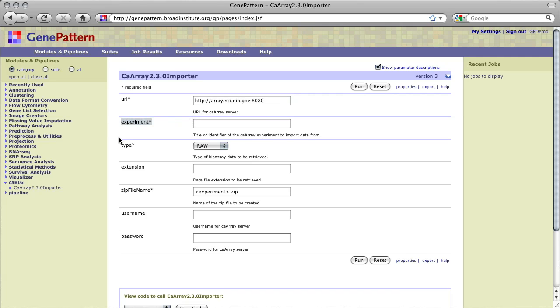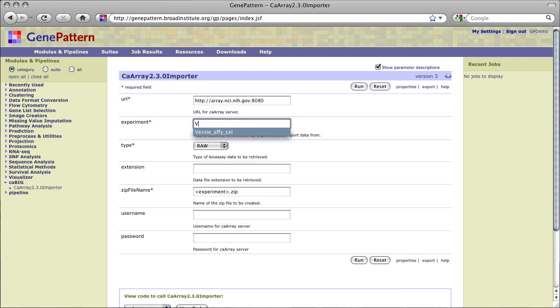The experiment refers to the title or public identifier of the experiment in CA Array from which the data is to be imported. If we didn't already have a title or public ID for an experiment, we could go to the repository we are using and browse to or search for the experiment which contains data we wish to import.